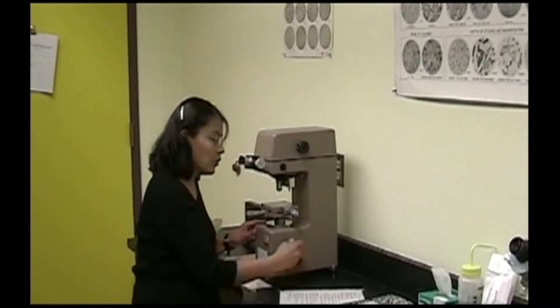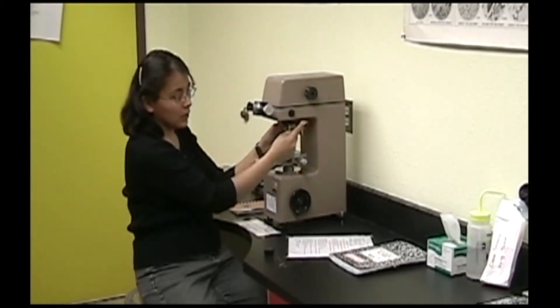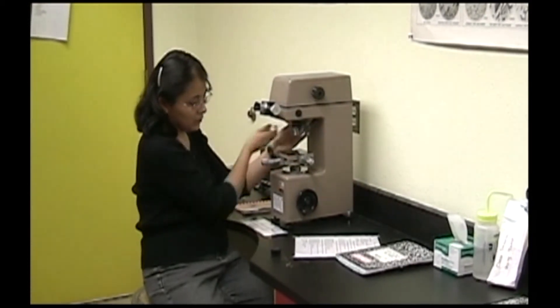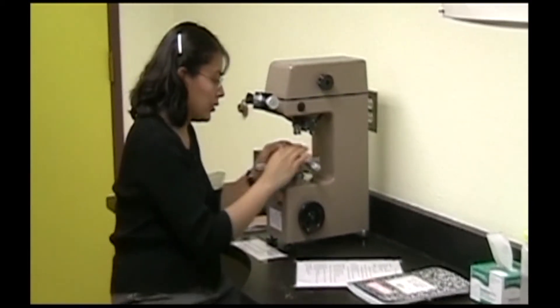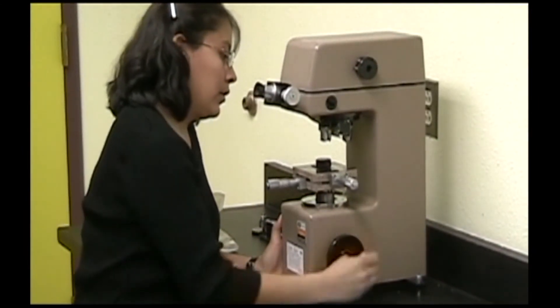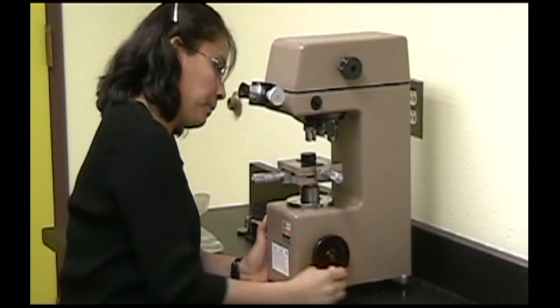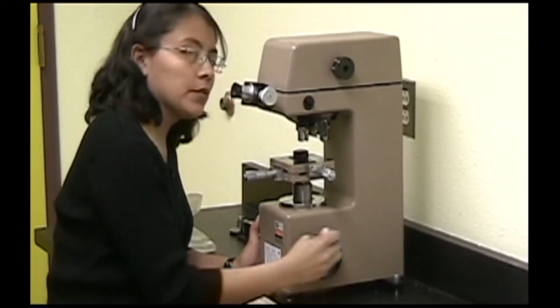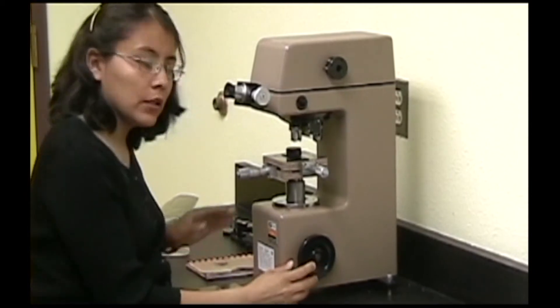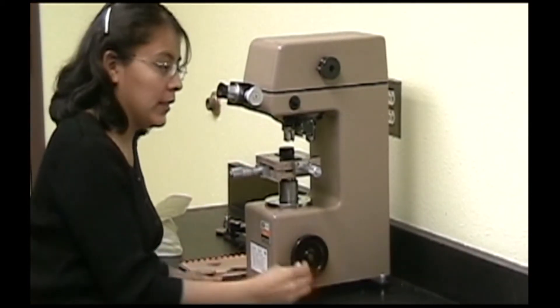Next, lower the stage slightly and switch to the 10x objective lens using this lever, then place your specimen on the stage. Raise your sample so that the surface is very close to the objective lens, but be careful not to ram the stage or the indenter into the objective lens.